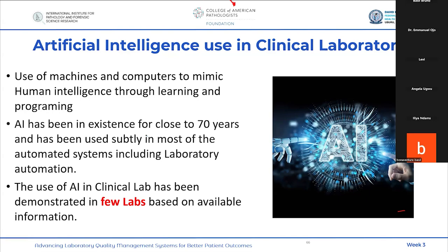The use of AI in the clinical lab has been demonstrated in a few labs based on available information. But we have only a few labs that have actually taken this, to say that they are concentrating on this, relying solely or mostly on artificial intelligence to generate results, especially in predictive diagnosis.